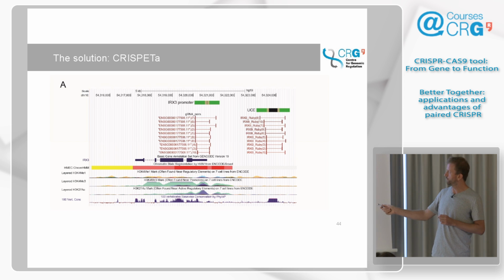And so one of the parameters in the software is deciding just how much a single half of the pair, a single example, can dominate all of the pairs. So you can tell it, don't give me 100% all starting with the same single guide RNA. Anyways, just details. Here's another, an upstream element, an ultra-conserved regulatory element, and there's another 10 designed pairs for that thing.